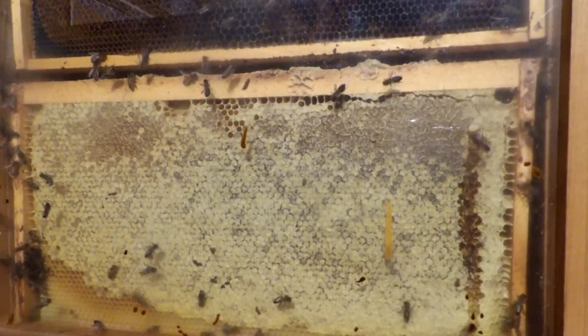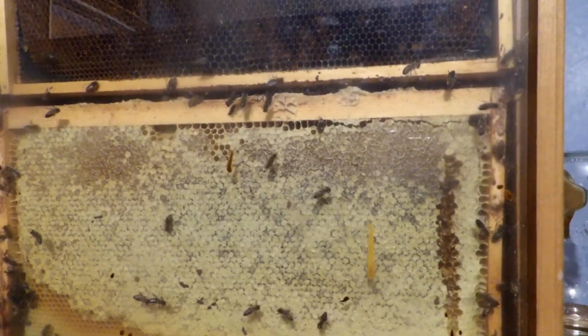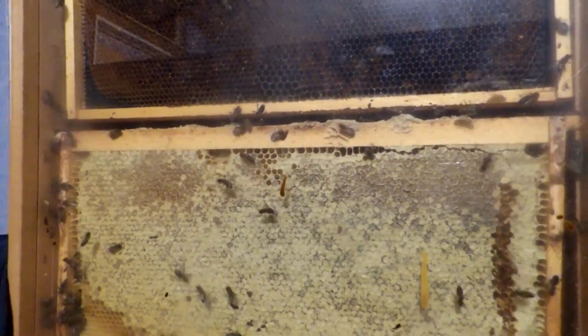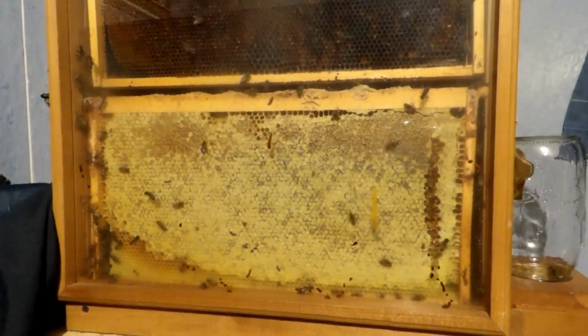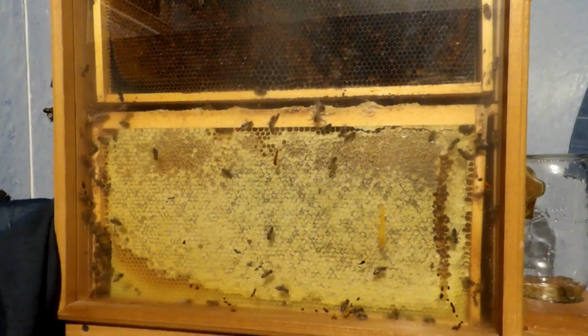And for that I have to catch 15 to do this test on them with a microscope to see them in the microscope slide. So where their feet are supposed to go, I took the plug out and I put this empty jar right here with honey. I wiped some honey on the inside, and there's a few bees in there. As they go in there, I'm going to capture 15 of them and put them in the container we use to do alcohol mite washes. And once I get my 15, I'm going to run my test on them.